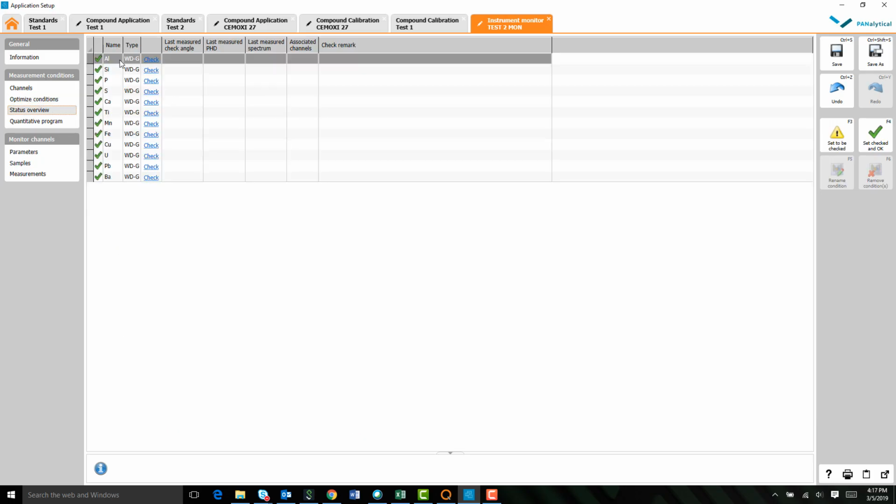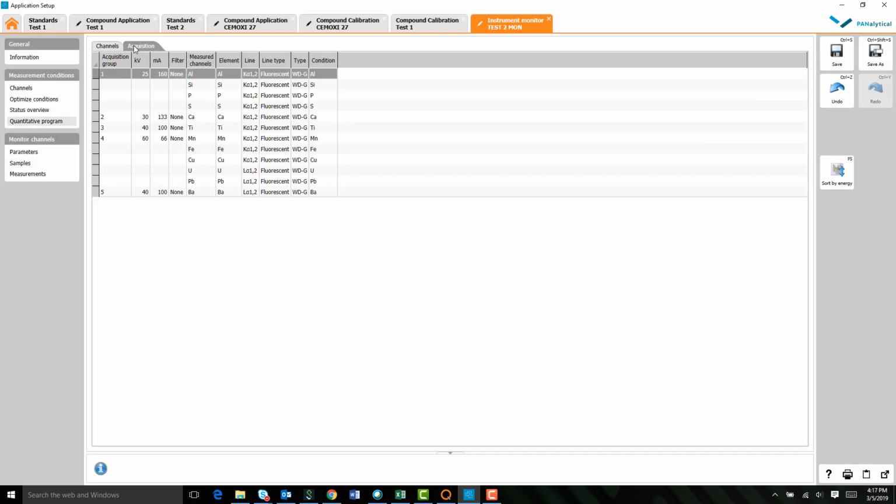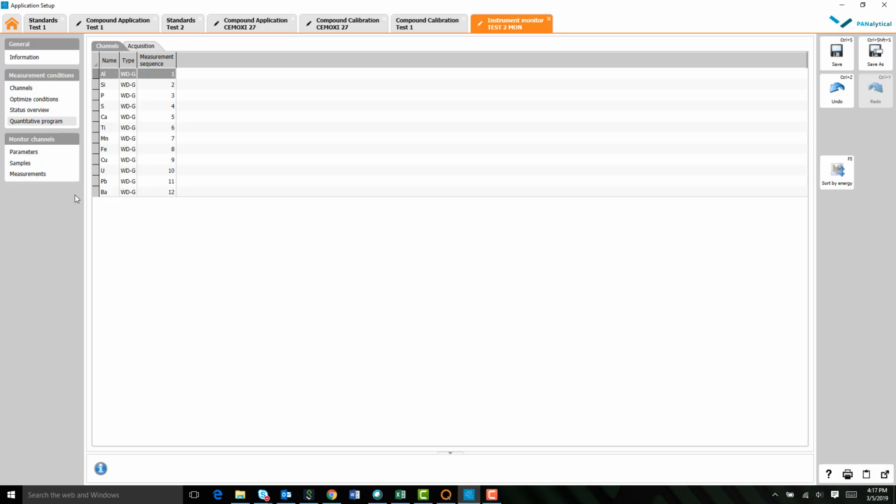It's going to give you each of those in green for the PHD and check angle. It's going to tell you when that was last done. And it's going to give you the quantitative program, which is the channel information here.